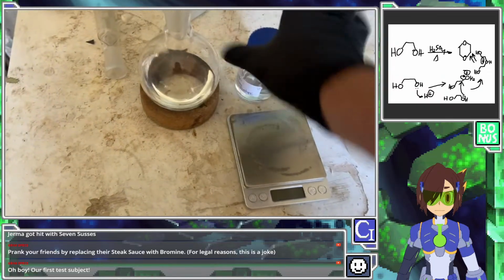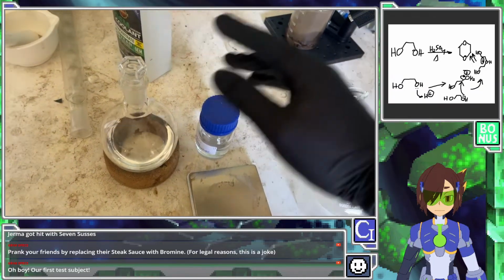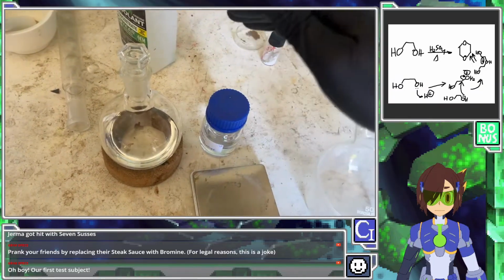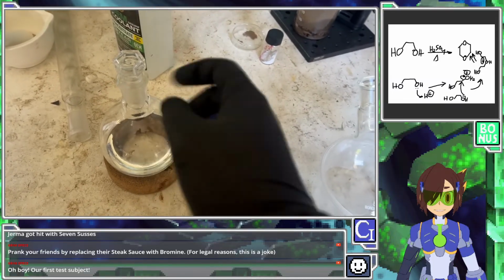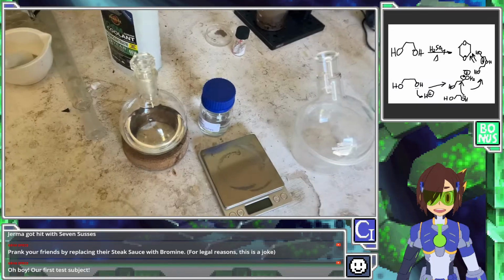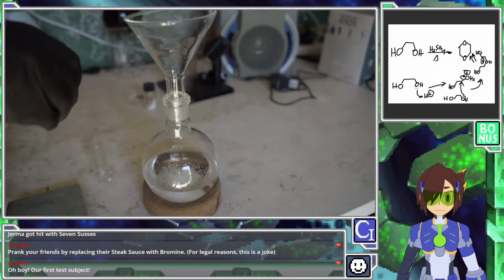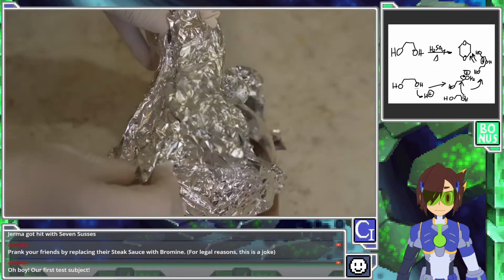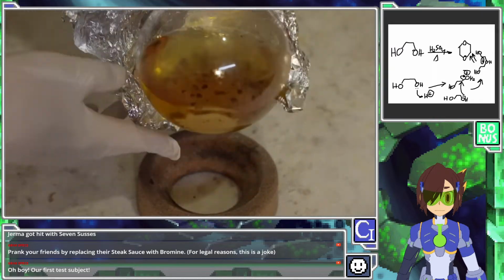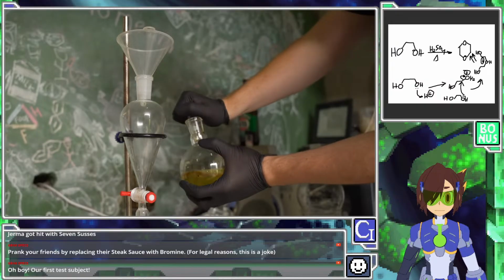All right, so we'll combine all our dioxane, water azeotrope, and add some sodium hydroxide. We want to neutralize any remaining impurities and also drag out the water until its own layer. So I hope it doesn't just turn into tar again. They still had even more to crash out. That would be so sad for him. Oh, that's sad for him. That's a lot of junk.